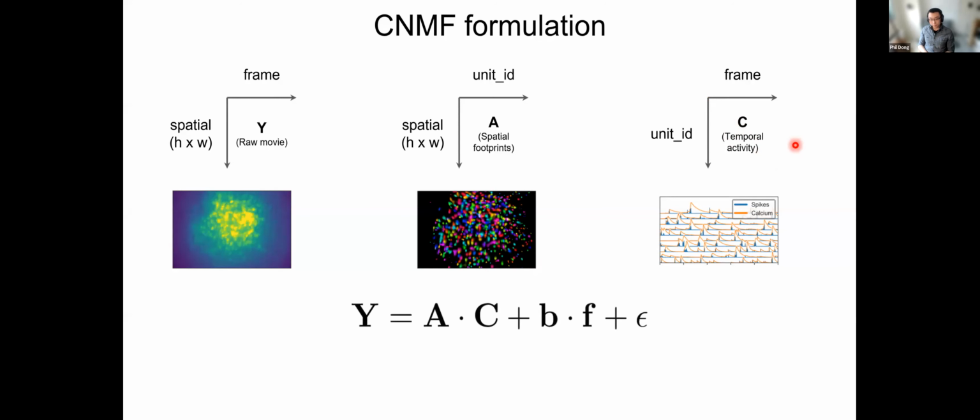Okay, so this sounds good, and it sounds like the CNMF algorithm is all we need to do next. But just like any other optimization algorithm, in order for CNMF to work, we need an initial guess of the two matrices A and C here, because what CNMF can do is to refine this for you, but it cannot generate this out of nowhere. So that's why we need to do another step right before the CNMF updates, and that's called seeds initialization.